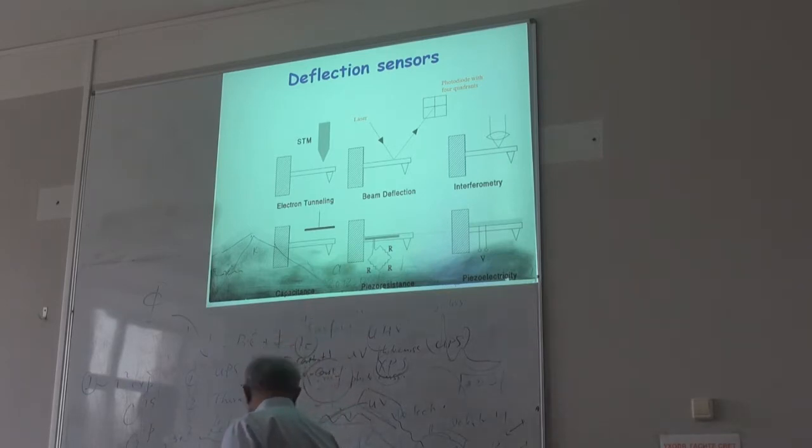The important thing is, once you do the AFM, you can measure the thickness. Suppose this is your substrate, right? Suppose this is your sample. So when you move from here to here, you see some height increase. From that you can measure how many layers are there. If you have many layers, then this height will be larger.